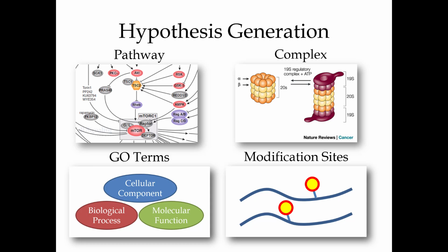Rather than just saying, I'm going to take the entire FASTA, you could certainly be focused on certain areas of the cell, using GO terms, or you can be focused on specific modification sites. This type of proteomics works very, very well for investigating PTMs. A lot of people are using it for phosphorylation and other PTMs. And spectral counting really doesn't work at all for that, because there are too few things that you're counting.